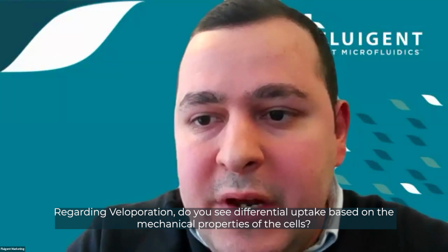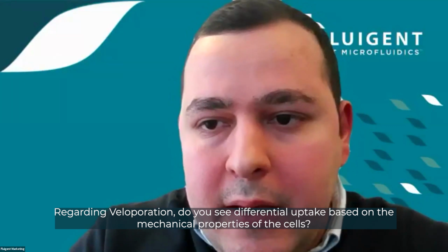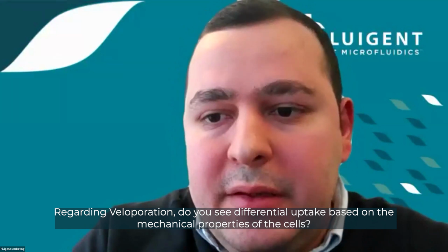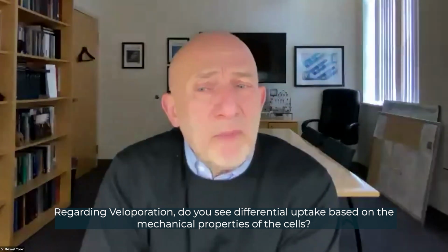Another question regarding veloporation. Do you see differential uptake based on the mechanical properties of the cells? Could you find a regime where cells would be porated differently depending on the mechanical properties? Yes, for each cell, we have done, I believe, 7 or 8 different cells, 3 cell lines and primary cells like neutrophils, T cells, NK cells, and stem cells.